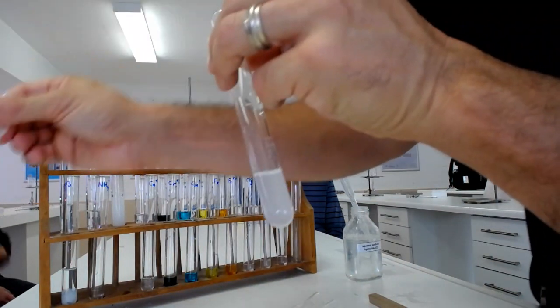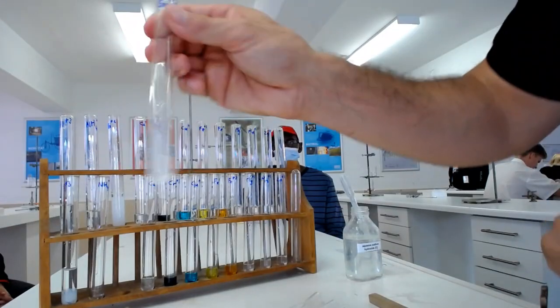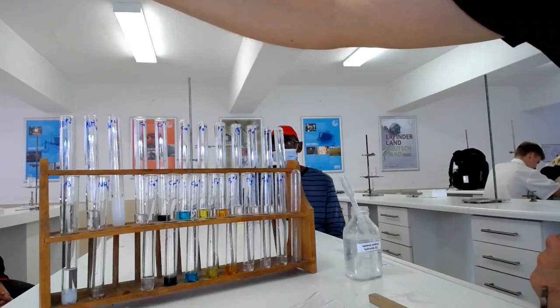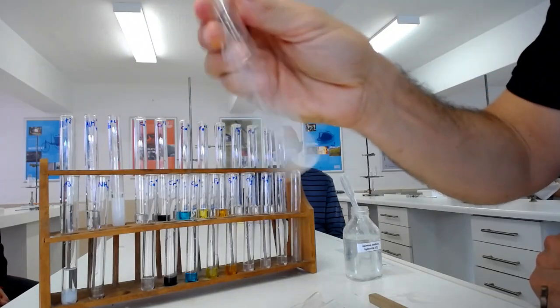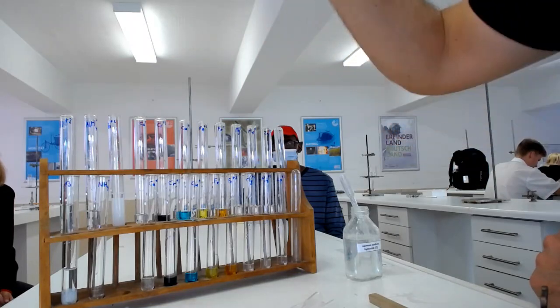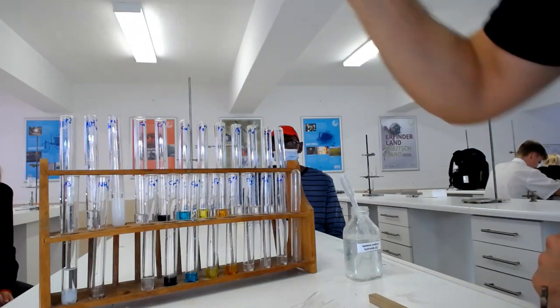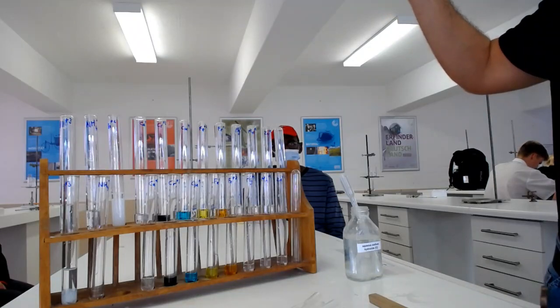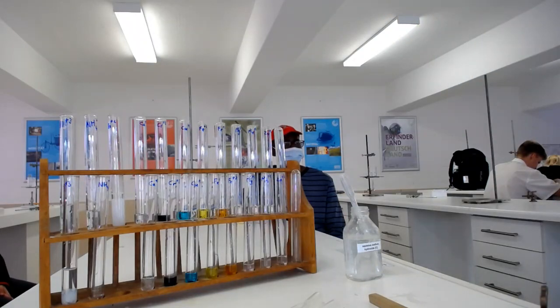There is something there. Look at it. Is the test lying? It's like soluble, but it's like not. It's like clear. But look at my barium in itself.